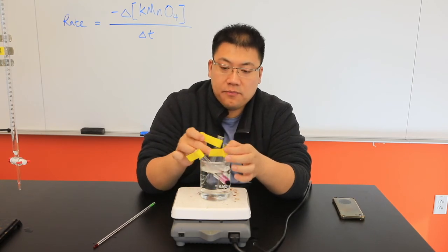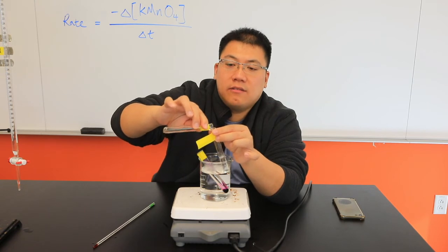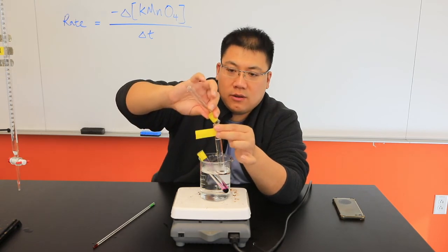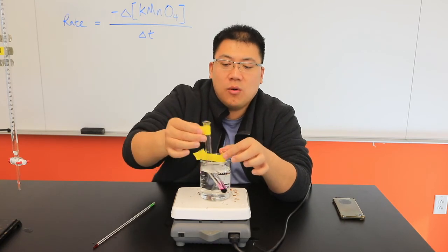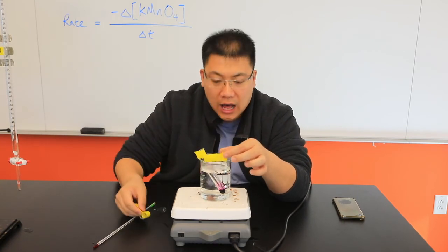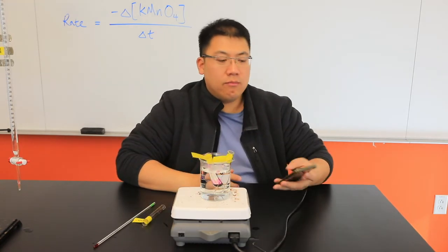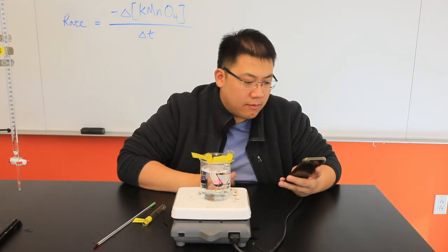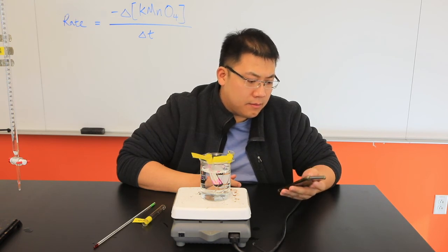First thing first, I need to add my water to the oxalic acid tube. Just like this. This reaction will be done in the hot water bath entirely. Let me get my timer ready.